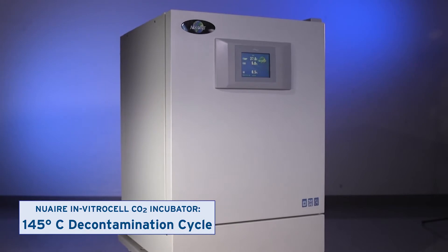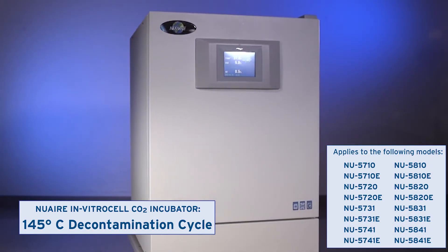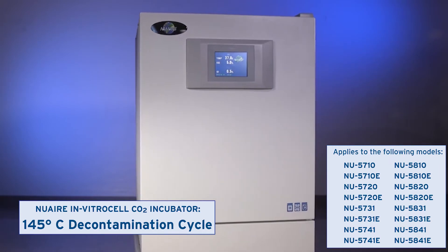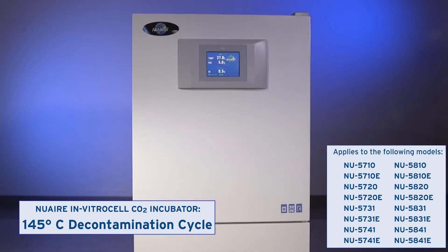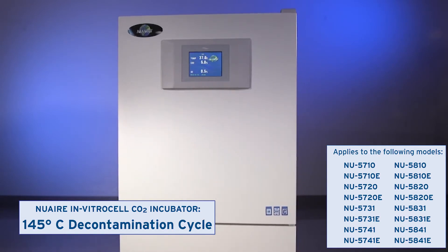This video shows how to run the incubator's 145 degrees Celsius decontamination cycle. Ensure the incubator is 10 inches or 25 centimeters away from the other incubators, and plan for the cycle to take 8 hours.